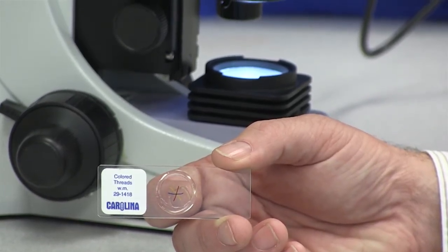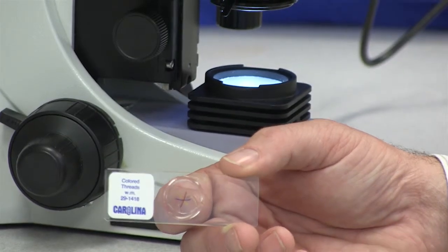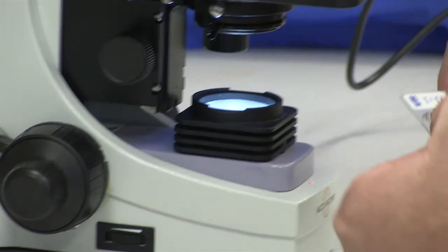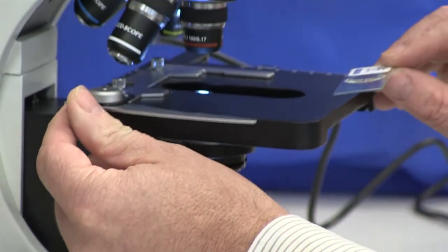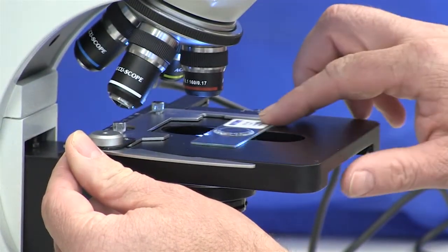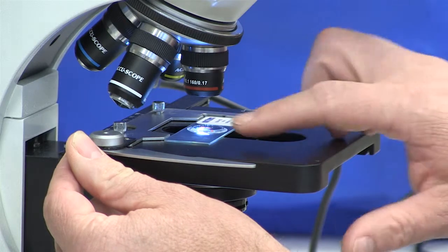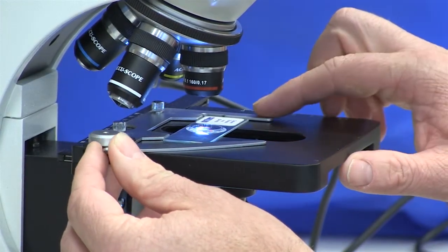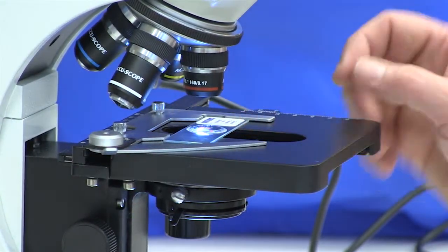The first thing we want to do is place the slide on the microscope. To do that, we slide one of the stage clips back and slip the microscope slide so that it's completely cradled by the stage clips.